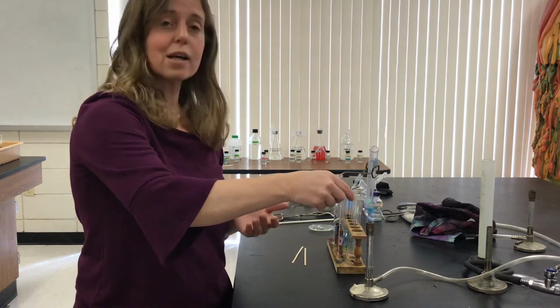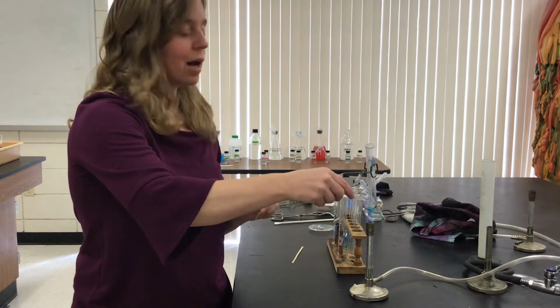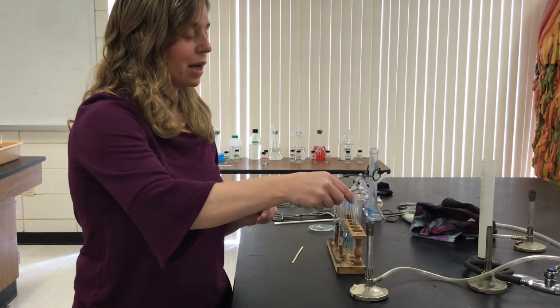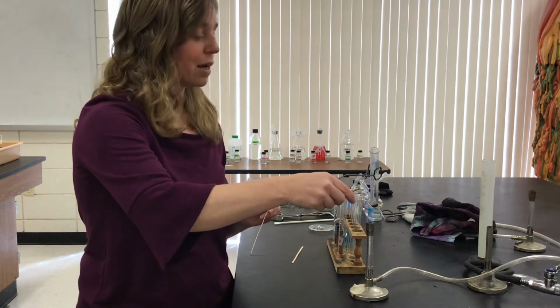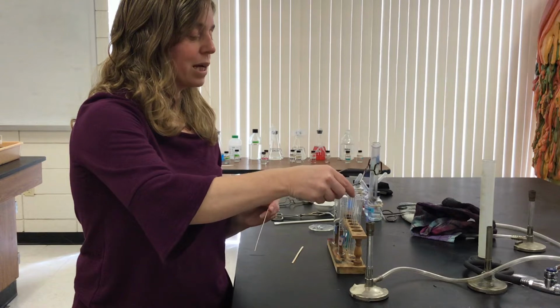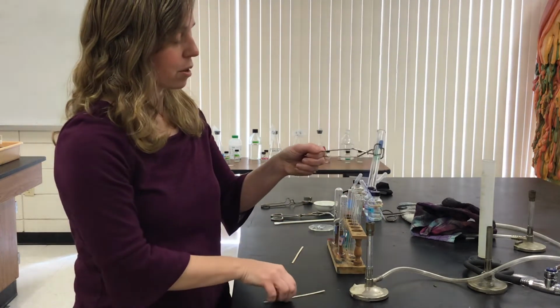But the carbon dioxide we're going to have to test for. So that's where this wood splint is going to come into play. Now, if you know anything about carbon dioxide gas, you know that it's in a fire extinguisher because it smothers a flame. So in essence, after we heat this, we're creating the gas that's in a fire extinguisher, okay?